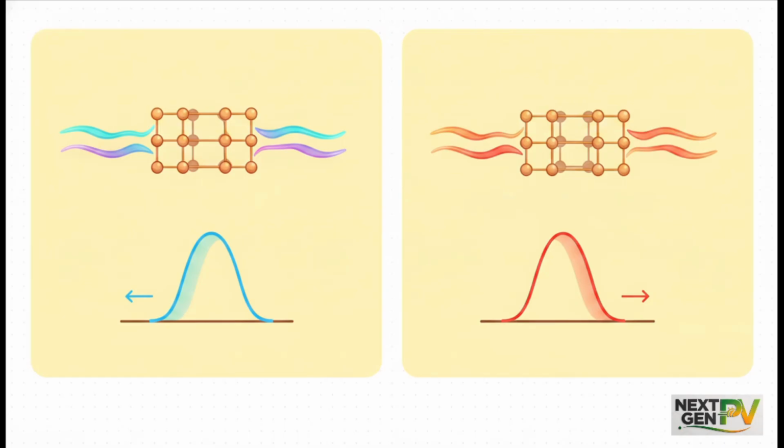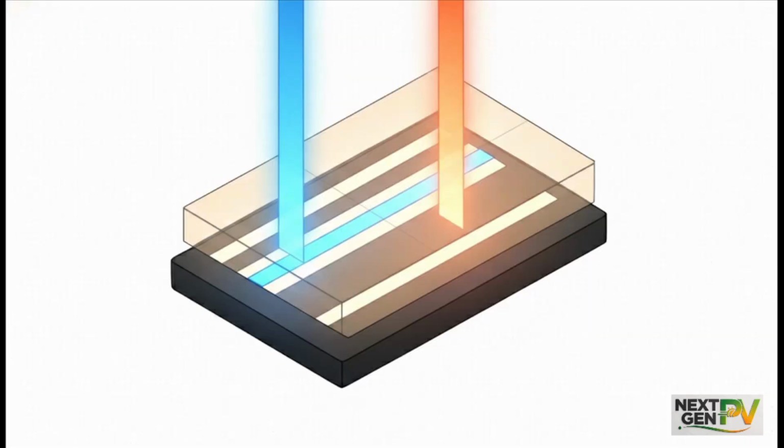Speaking of internal distortions, let's talk about strain. Perovskites are mechanically soft. They can easily develop residual strain during film formation, cooling, or thermal annealing. If the lattice experiences tensile strain, it expands, d increases, and that diffraction peak shifts over to a lower 2θ angle. Conversely, if it experiences compressive strain, the lattice contracts, d decreases, and the peak shifts to a higher 2θ. This is absolutely vital to track, because residual strain directly impacts non-radiative recombination and the long-term stability of the solar cell. But hey, it gets even more complex.